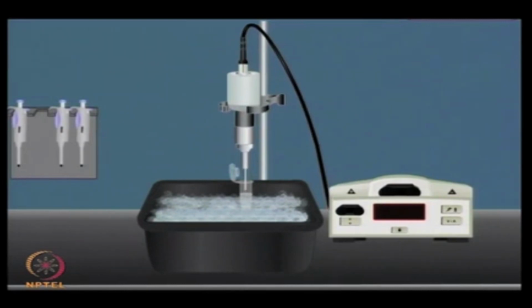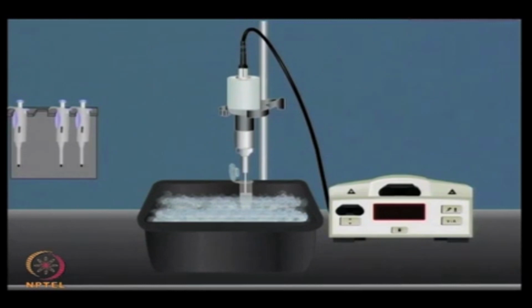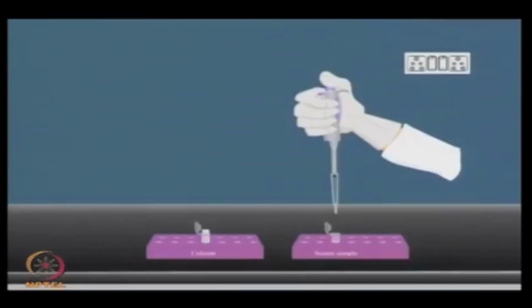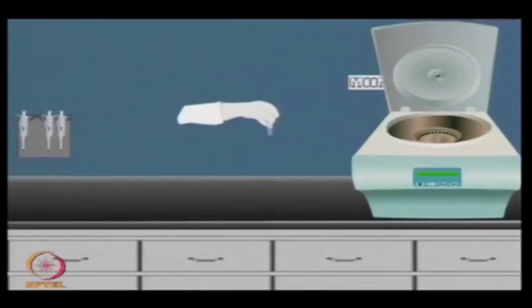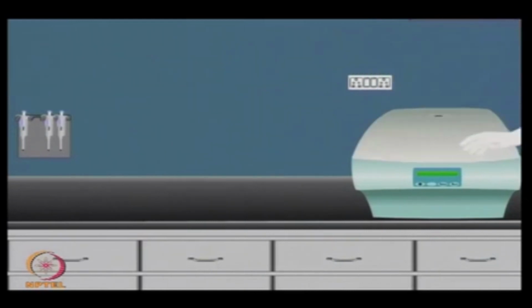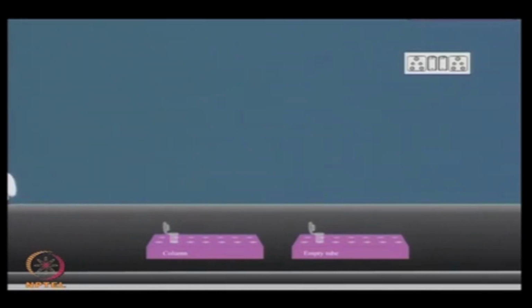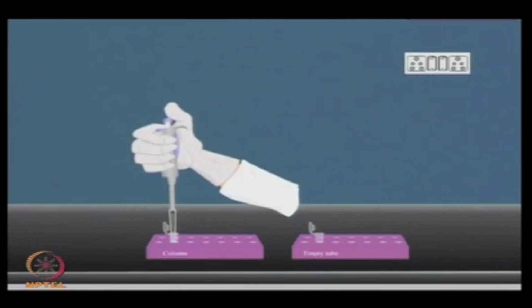So, in this experiment we tried both sonication and depletion of the high abundant proteins. After sonication is done, then we can add the serum sample on the columns. Usually these are commercially available, which can deplete various high abundant proteins. Now, these depletion columns bind only the high abundance proteins onto their matrix through the affinity interactions.